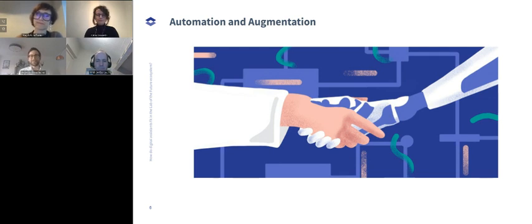So there are certain steps you would never think of in your manual workflow that you need to take into account. And that might be simple things like stirring, heating it up a bit more, and waiting times and all of that. So that is also a kind of skill. And for that, you can't easily just train an AI, because you have to discover a certain space around it. So until that can be taken up by a machine learning model or AI, that will take some time.